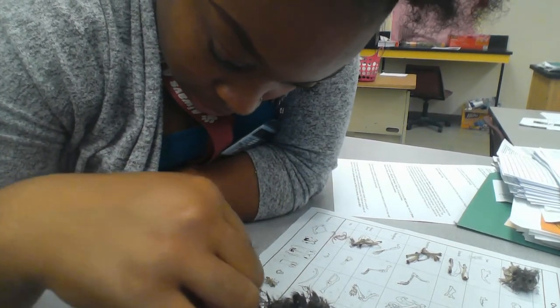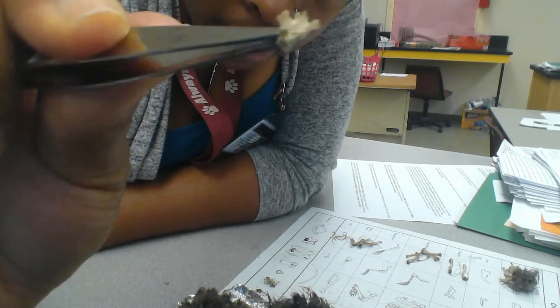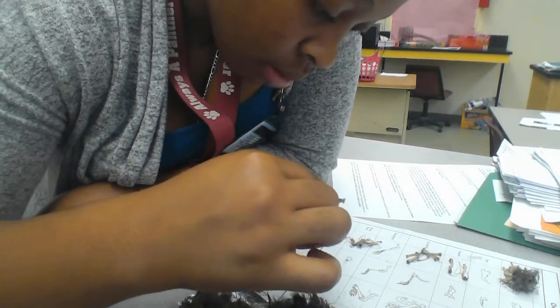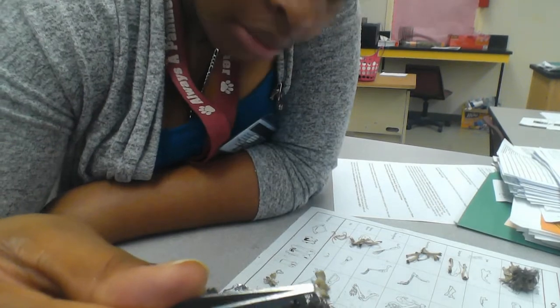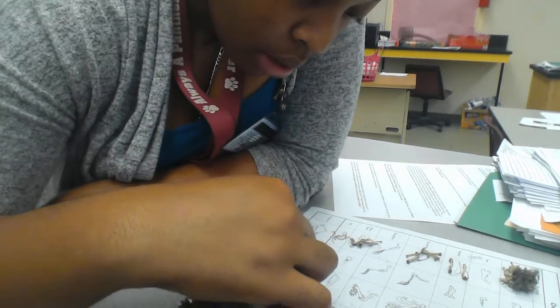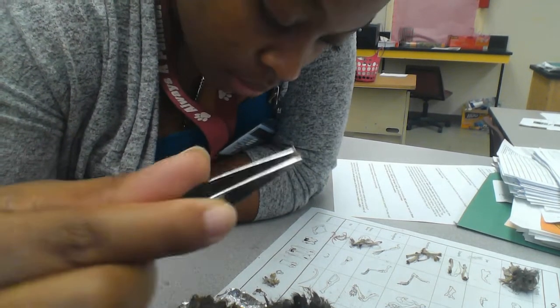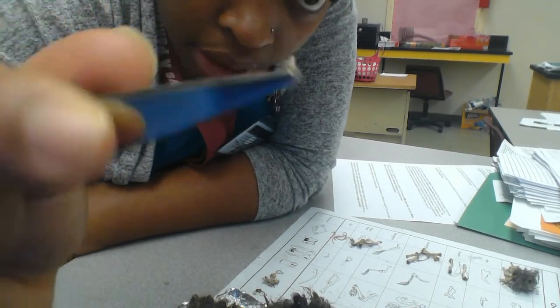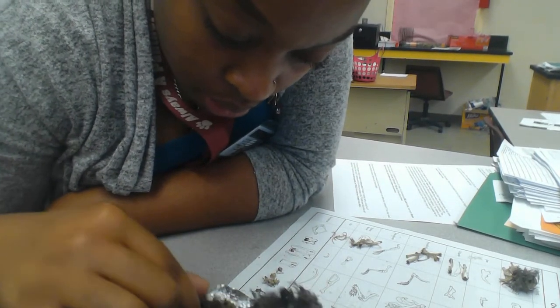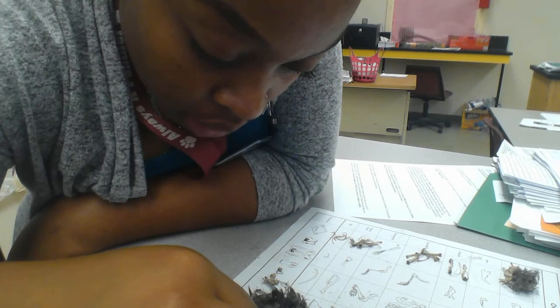It's another one of those second to last vertebrae. I can find another one of those. This one's a little different, but not too different. Part of their spine. And here's a tinier one. This one is that third to last vertebrae, the big hole in the middle. All right, and another rib.